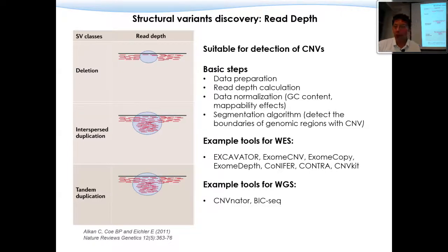One other point is, this figure is plotted in a way where everything is continuous on the genome, right? Sometimes this will fit whole genome sequencing analysis. But if this is whole exome sequencing, different exons may not connect together, so the breakpoint approach may not be feasible. In that case, the read depth is the primary information you'll be using.